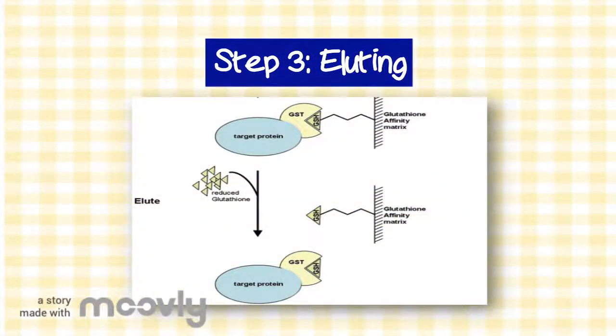Step 3. Elution. The purified GST-tagged protein can be dissociated off the column and eluted by the addition of an elution buffer containing excess reduced glutathione to the column. The free glutathione competes for bound glutathione as a substrate for GST's active site, which allows for the displacement of the immobilized GST with the excess glutathione, resulting in elution of the GST-tagged protein in the flow-through. The flow-through is collected in a microcentrifuge tube and is ready for SDS-PAGE analysis.